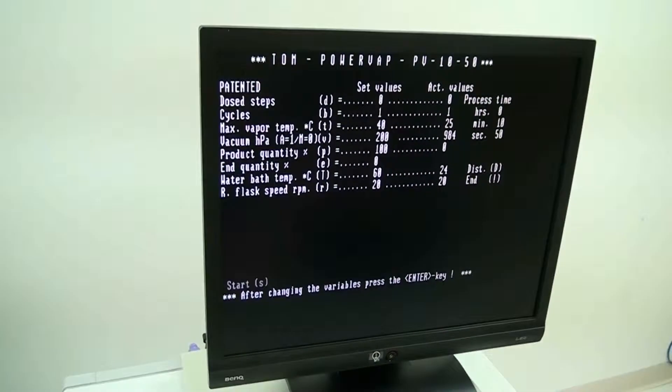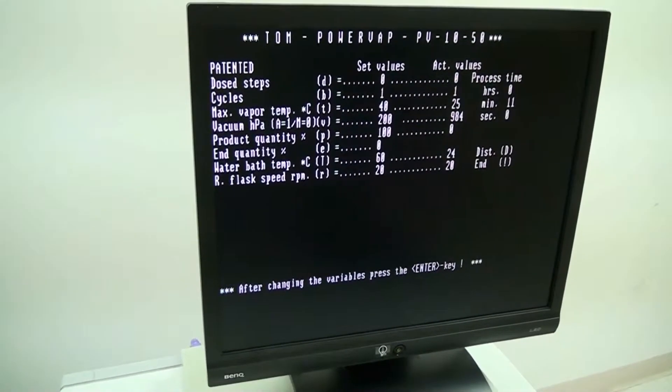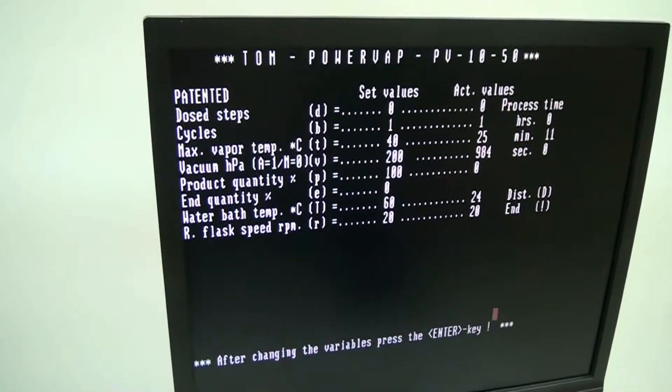Can we go ahead and hit the run button and see what happens? That's the S key, no enter required, and the system will start.